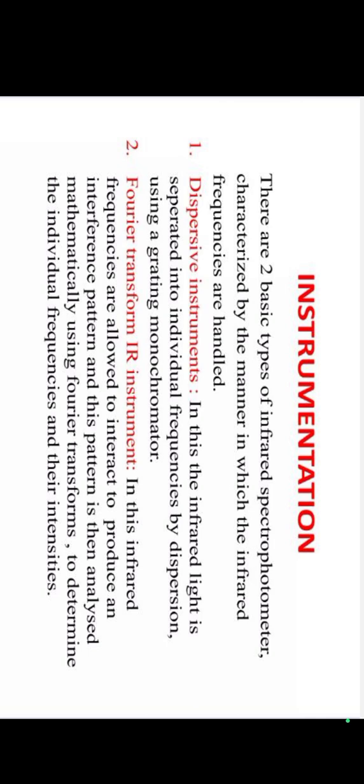Next we see the instrumentation of infrared radiation spectroscopy. There are two basic types of infrared spectrophotometer.